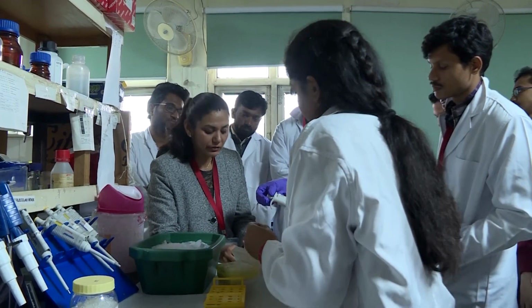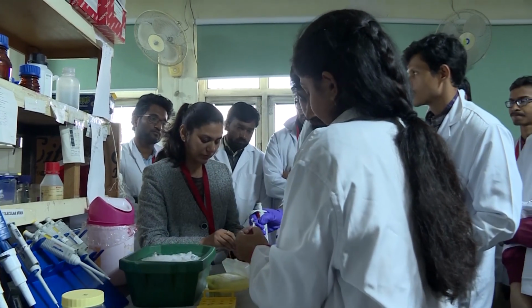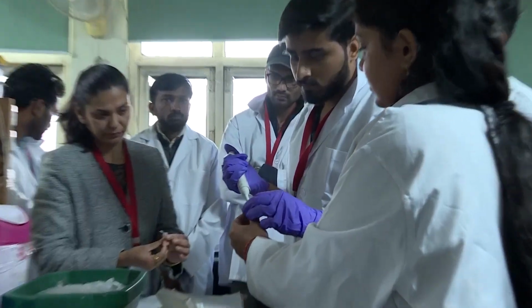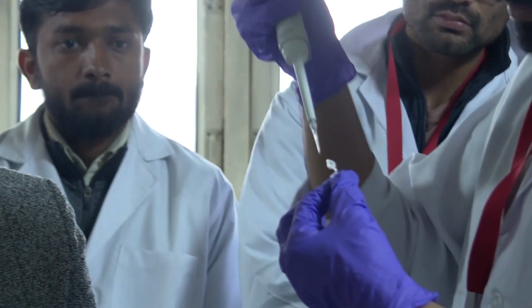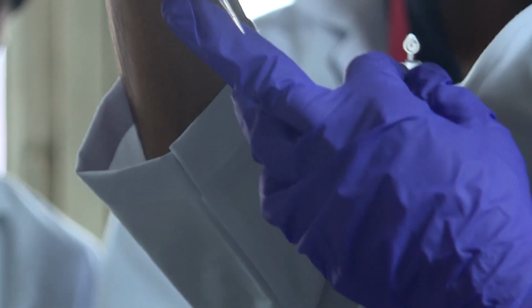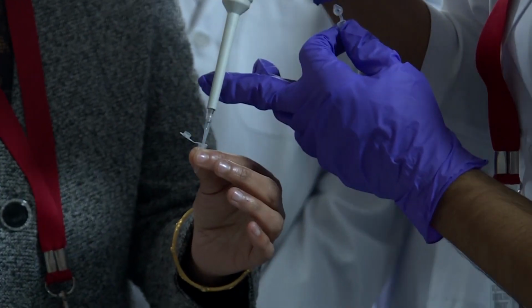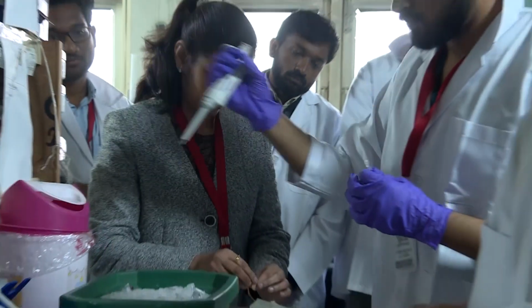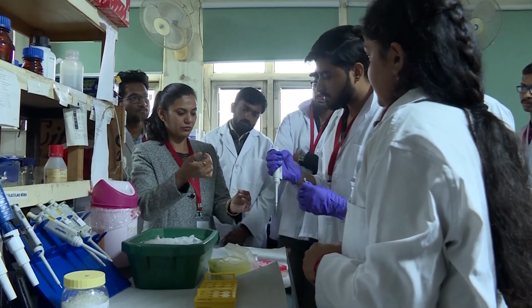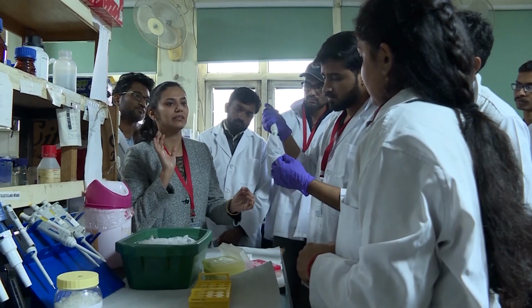This is heat stress. 2 microliter of cDNA will be added. Sometimes it happens that while doing this, if your tip touches anywhere else, then immediately change it.